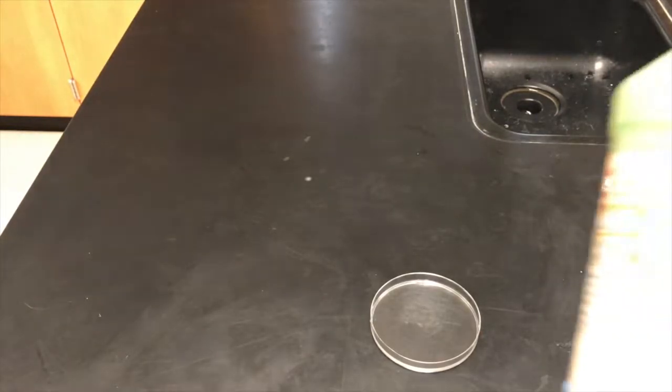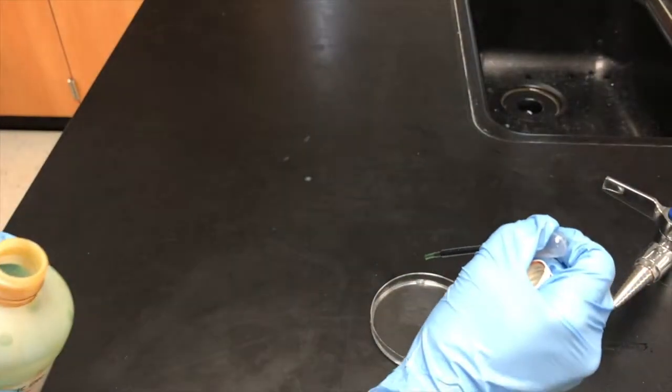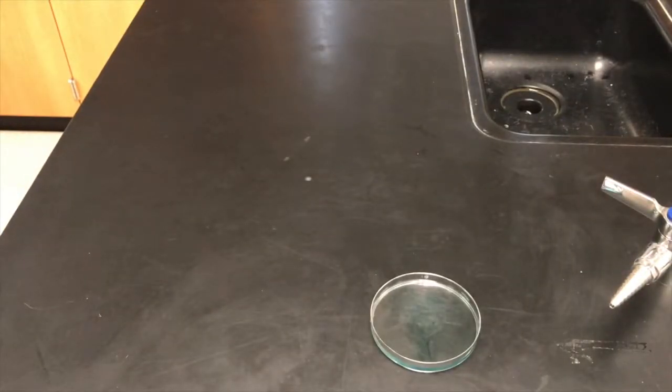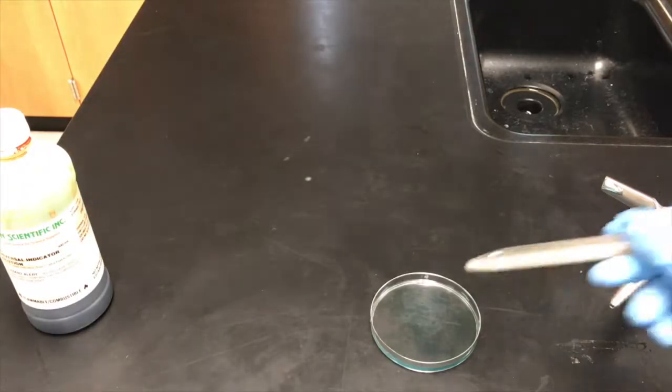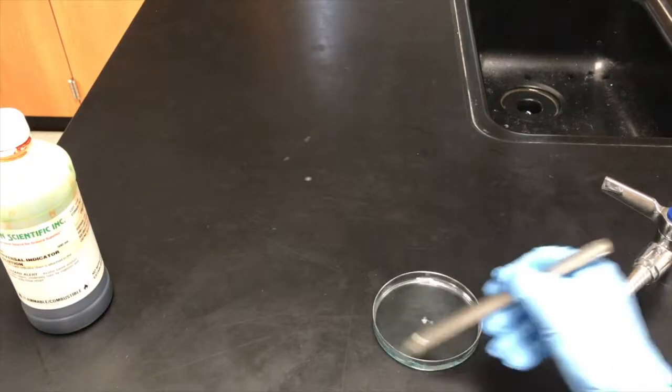The other solution I need is my universal indicator. So I'm going to grab a pipette and add just a couple of drops of my universal indicator. And then I am going to take my spatula and stir it. Okay, so it's kind of bluish in color right now.